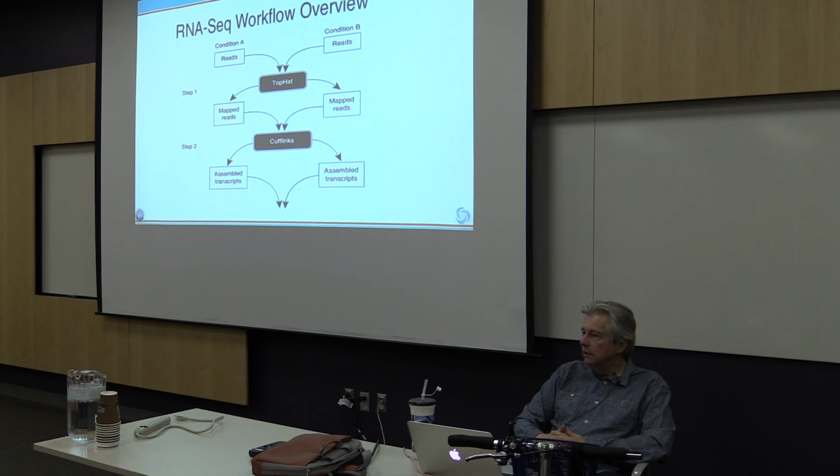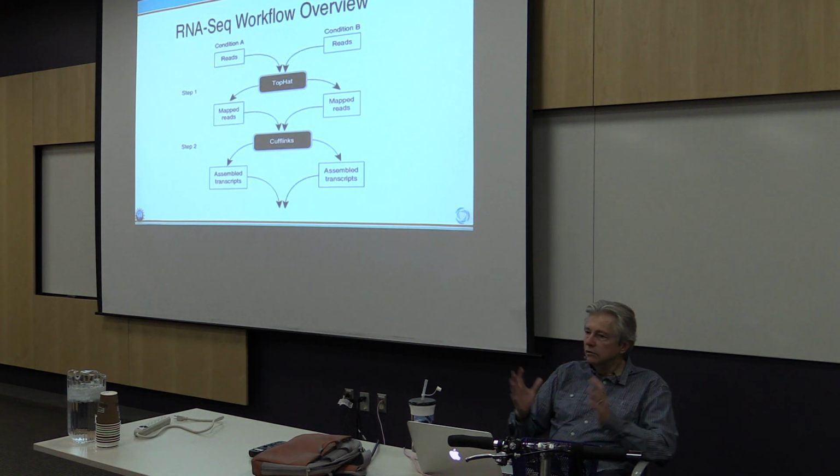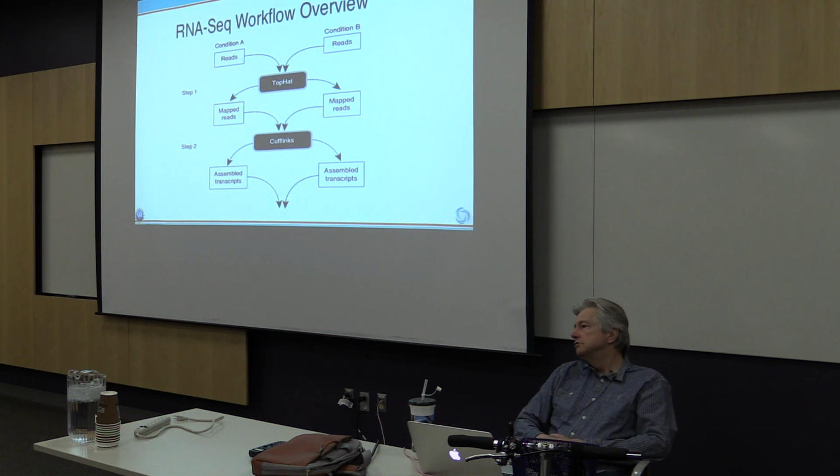But it's different when you're doing reference-based assembly. In reference-based assembly, you already know to some extent what your answers are likely to be, what your transcripts are likely to look like. You may come up with new transcripts, and if they're well-covered sections of genes, and they piece together differently from what is seen in the annotation, and you have your settings loose enough so that you're not pushing everything into the annotation information, then you'll come up with new transcripts. But here again, this is where you balance your tools.